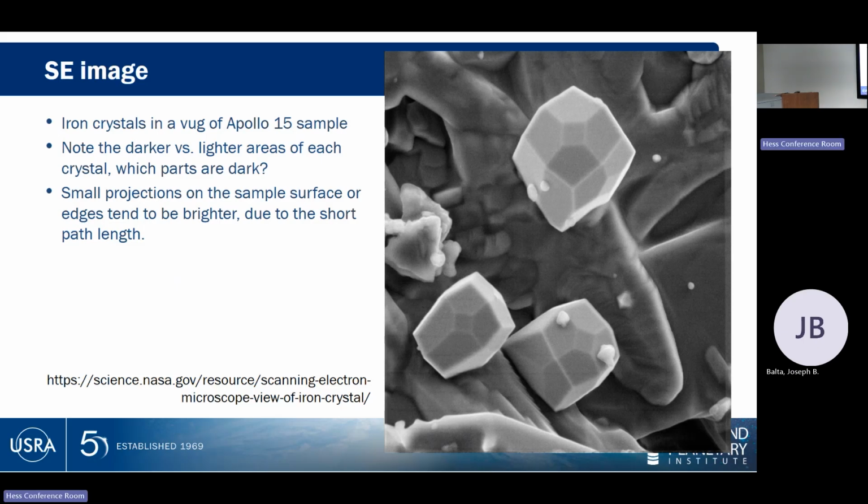They pop out in secondary electrons because the edges are the things that brighten up out of this. Small bits on this, little things that protrude, they tend to show up as brighter in secondary electron imaging because instead of it backscattering straight at my detector, it's spreading out in the sample and then escaping out the edges, making the edges of things the spot that stands out.